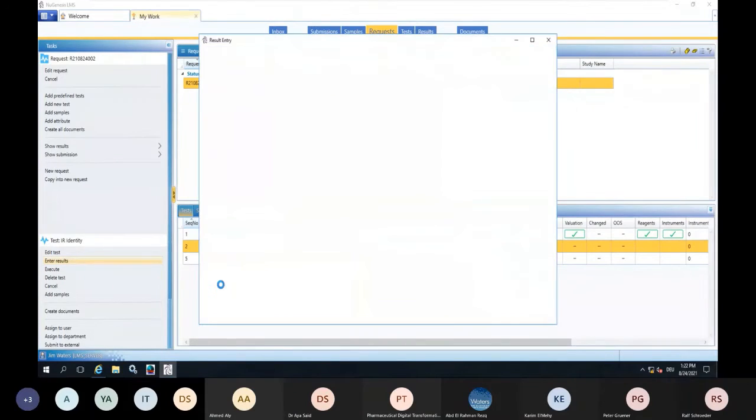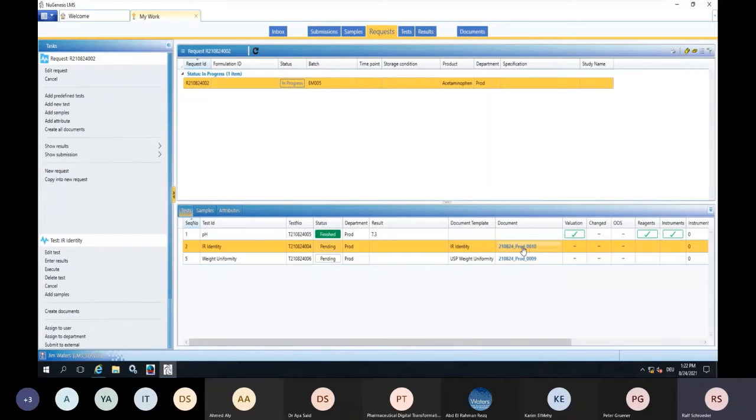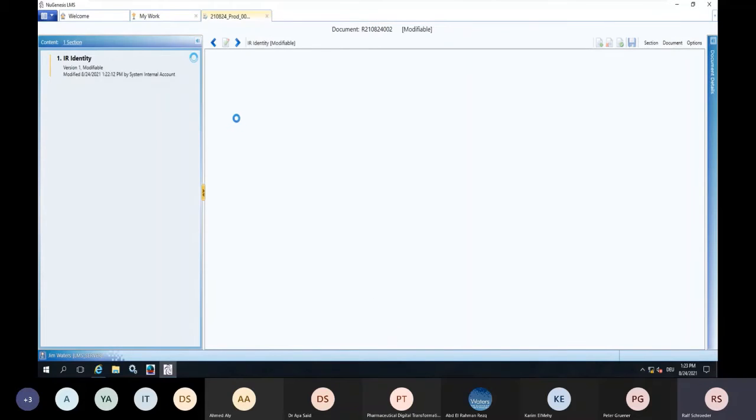in here the same way as we did for the pH, there is no option here, because the system suggests or requires that you put your information into the document which was created for this analysis. And like Karim has presented, these documents are at least partly designed in Excel, and we will see how we fill it with life. So let's see how fast my system behaves.